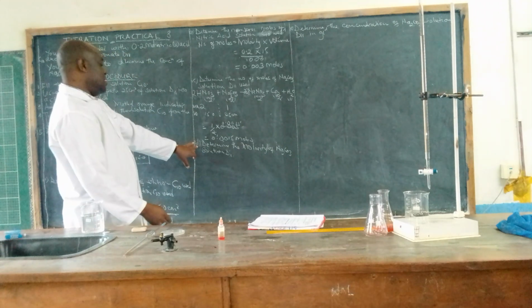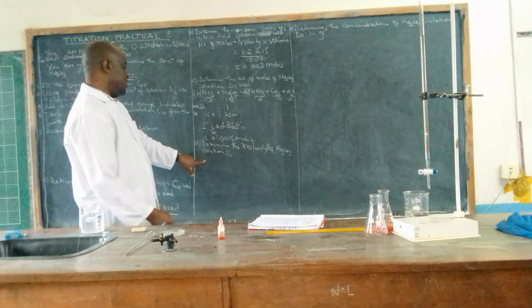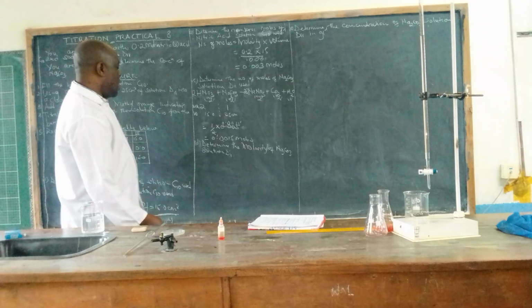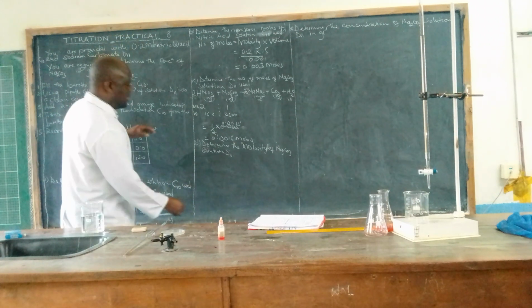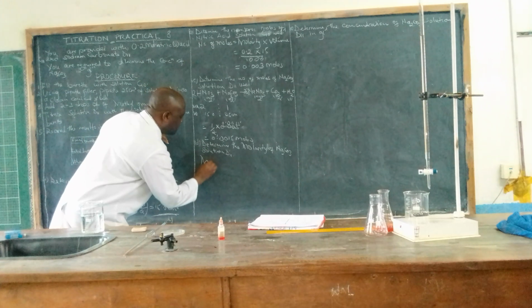Part D. Determine the molarity of sodium carbonate solution D11. Now we have been told to determine the molarity of sodium carbonate D11.